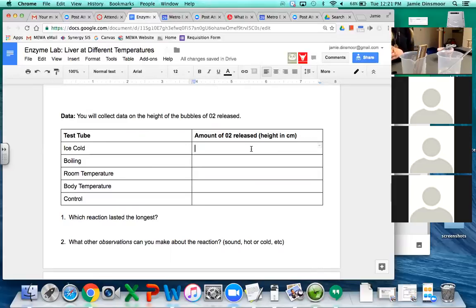And then after we do that, I'm going to prove to you that oxygen is being released. And I'll explain how I'm going to prove that later. But it involves fire, so it's fun. All right.